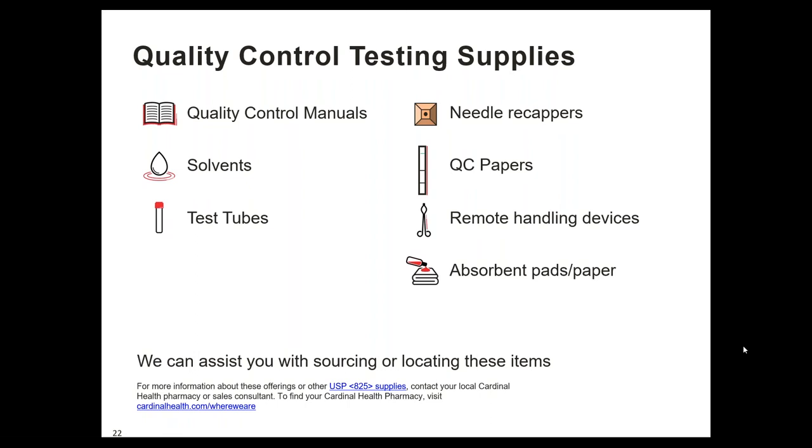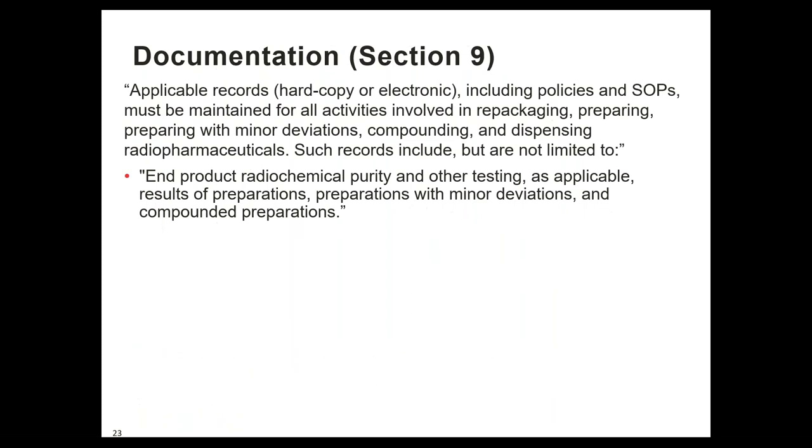that needle cap and get your fingers. So you might consider getting a needle recapper just so you don't get bloody. But there are resources available if you need assistance in locating some of these items.